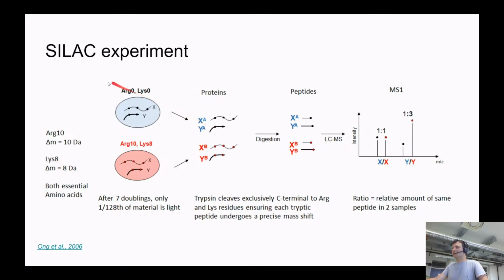The next topic is called the SILAC experiment. This is a very important topic, and it was also very crucial for the first huge measurement of proteomics, the very first truly quantitative proteomics. The SILAC experiment was probably very popular 10-15 years ago. It's still popular for specific applications even now, but label-free, without any labels, is actually the winner. Anyway, what's a SILAC experiment?